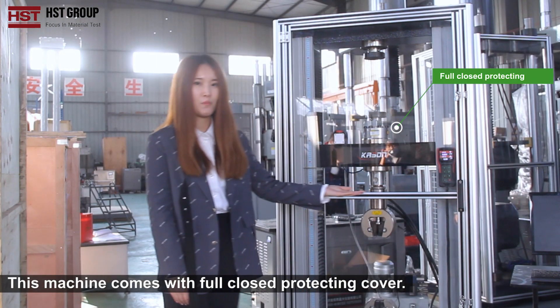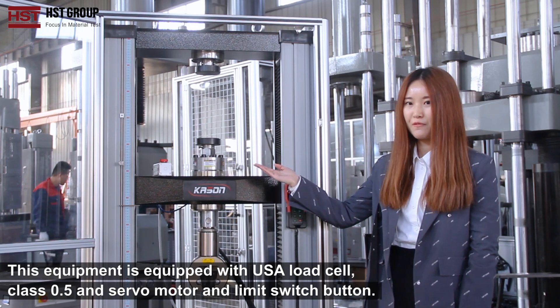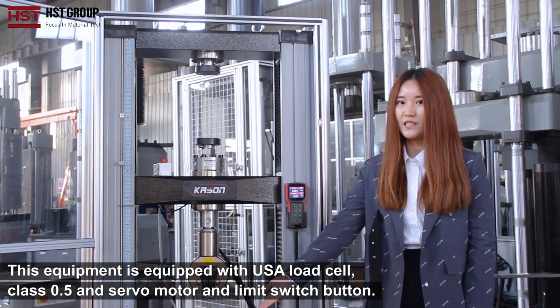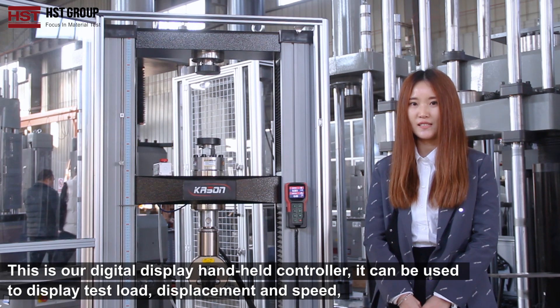This machine comes with a full closed protecting cover. It is equipped with a USA load cell class 0.5, servo motor, and limit switch buttons. This is our digital display handheld controller, which can be used to display the load, displacement and speed.